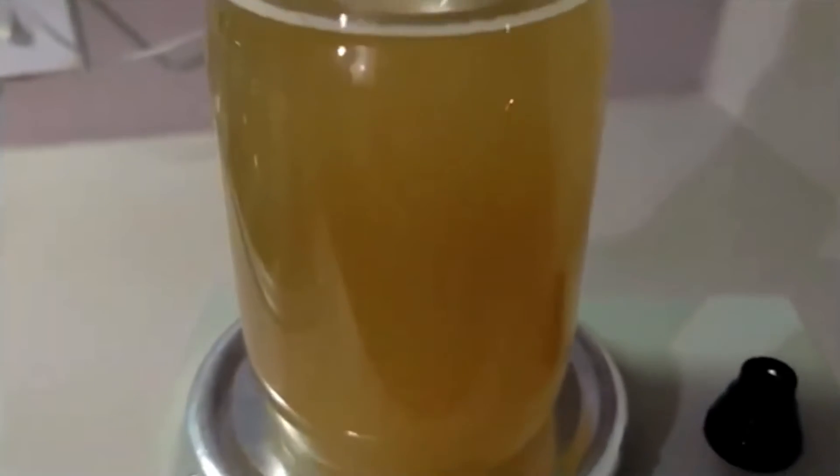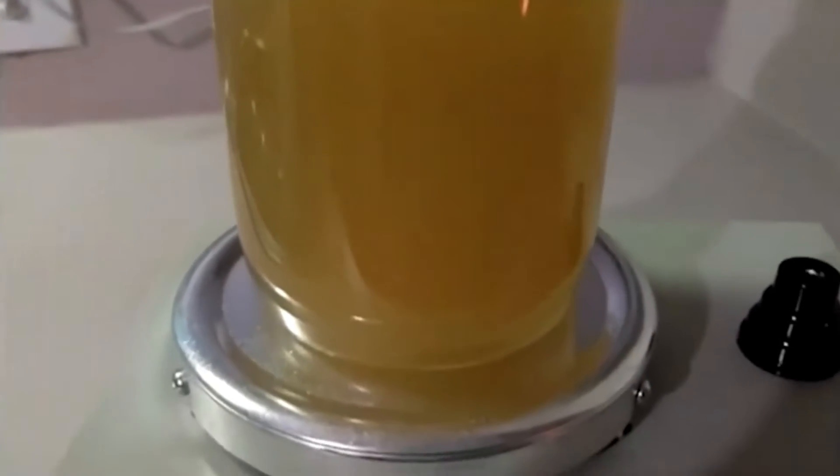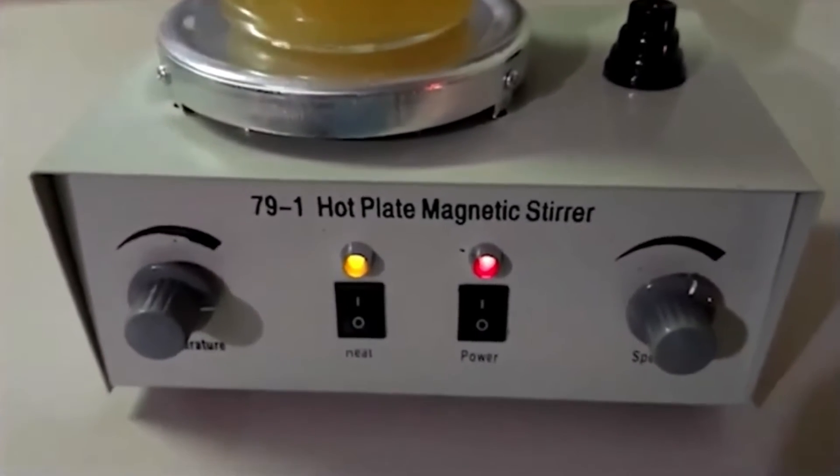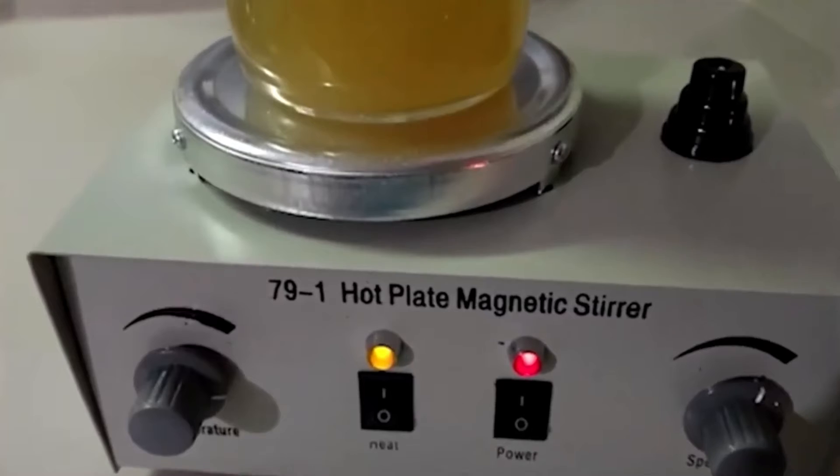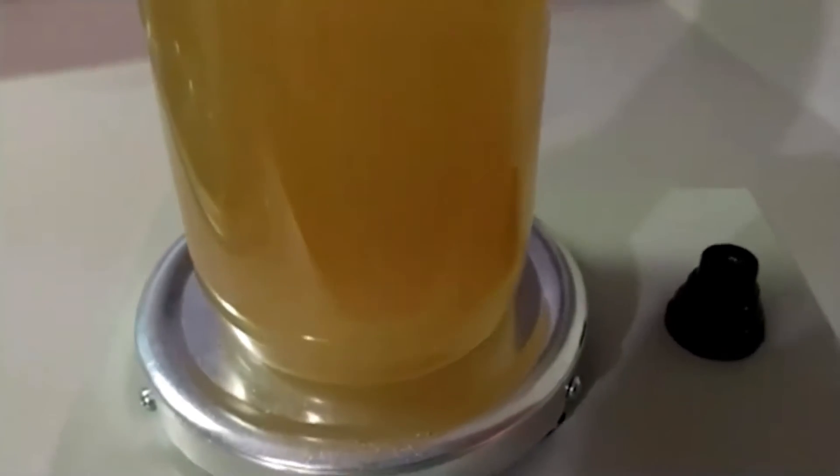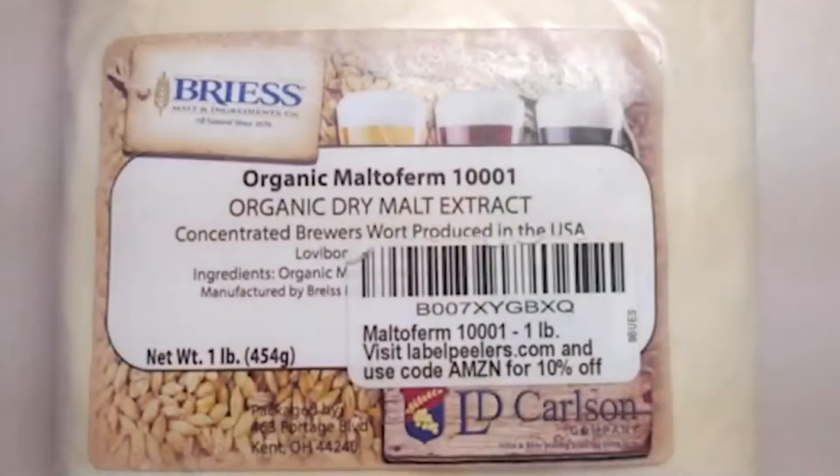We started with the standard 10 gram agar, 10 gram malt extract per 500 milliliters of purified water and definitely got quick tomentose growth, but it was hard to determine what was good mycelium and what was possible contamination.